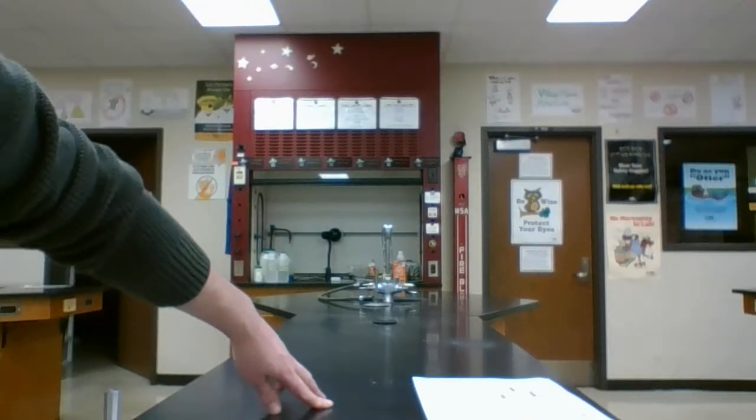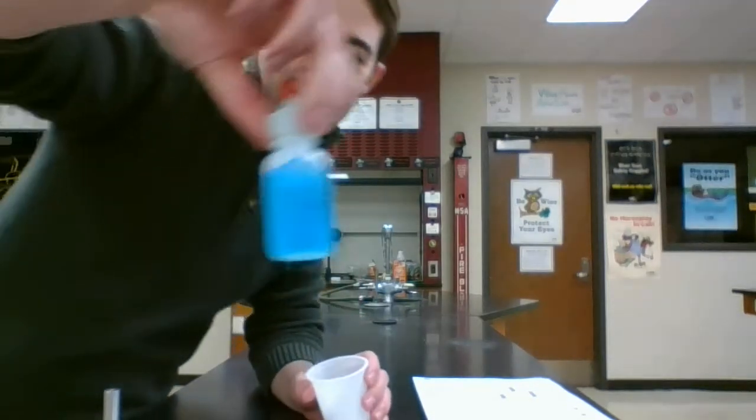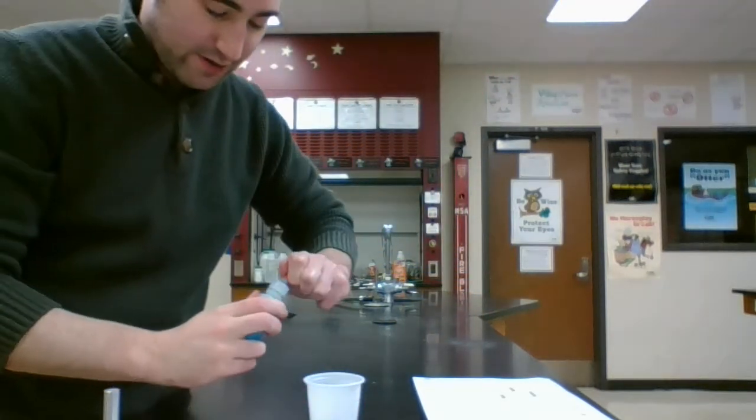Now we can also make aluminum go through a change at this station. I've got a little bit of aluminum foil in the bottom of this cup here. I've also got a chemical called copper sulfate, or CuSO4. I'm going to add about 20 drops in here.